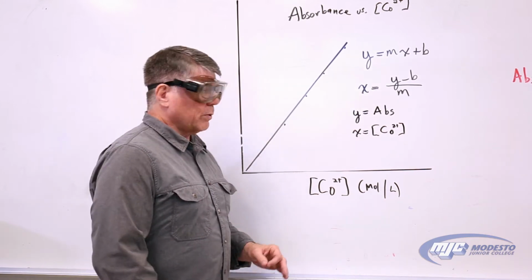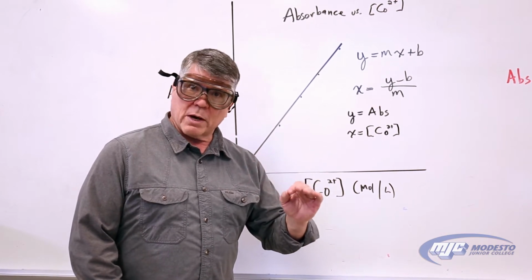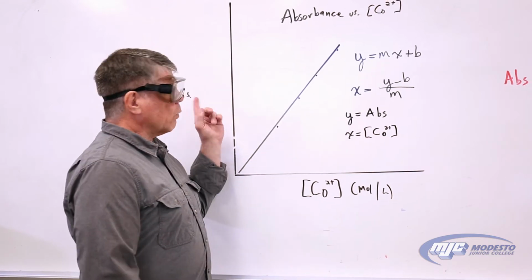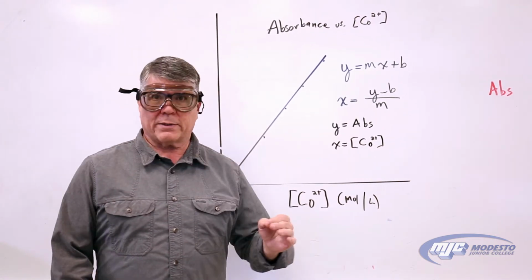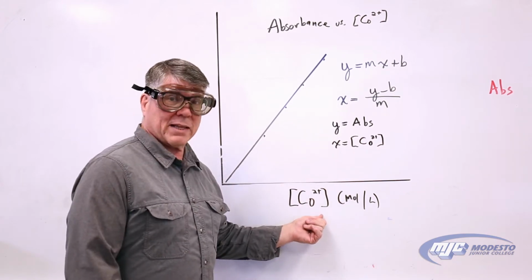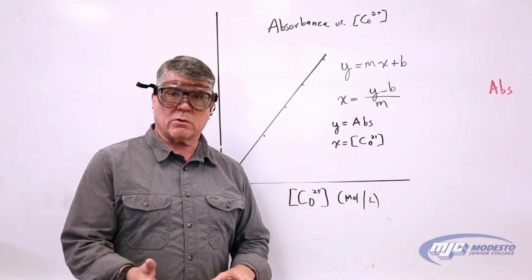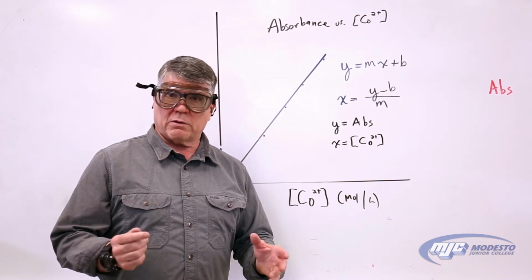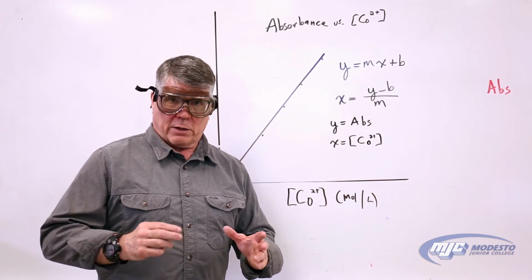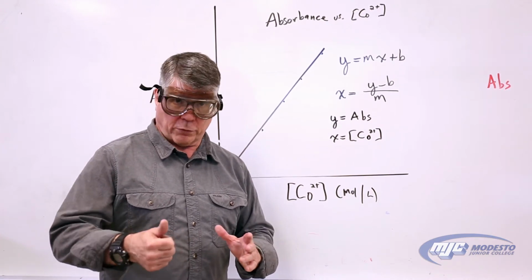The idea is we pick a variable, it's been picked for you, that depends linearly upon the concentration of the ions. It ends up that the absorbance of light by an ion is linearly related to the concentration in that solution. So the basic idea is we're going to use an instrument called a spectrometer that shines the light through our sample, and it rotates through different wavelengths between 400 and 900 nanometers at first.